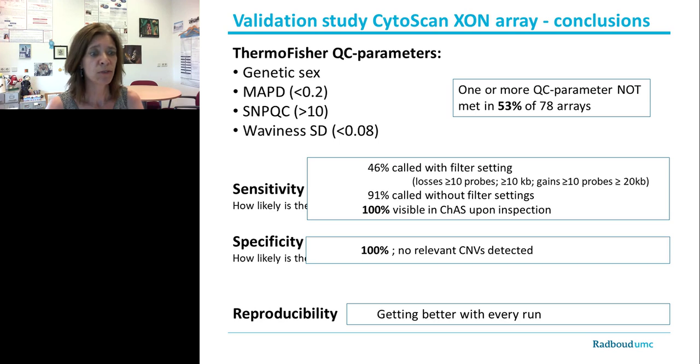As far as the specificity is concerned, no relevant CNVs were detected, and reproducibility improves and is still getting better with every run.